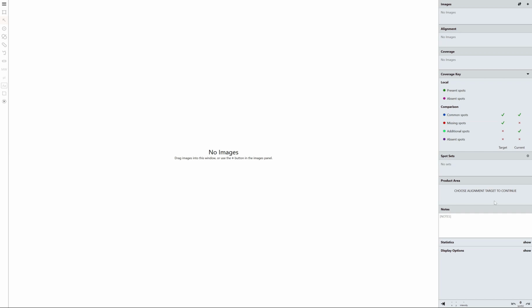the viewer. So I'm going to show you the tools, show you how we do it and explain some of the rationale behind the tools. But if you have a look at this and say, oh, well, he's not accounted for every single spot or he's not split that spot there, that's not what this video is for. You would obviously take the time to do it properly and go through and do that yourself.